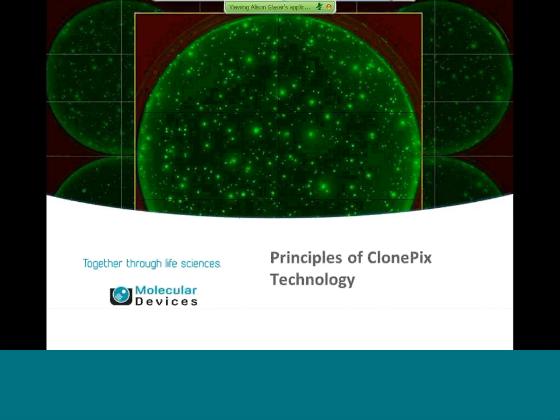Prior to discussing the work done with detection of functionally active GPCR targets, I will discuss the fundamental technology behind the ClonePix and how it can assist your workflow.